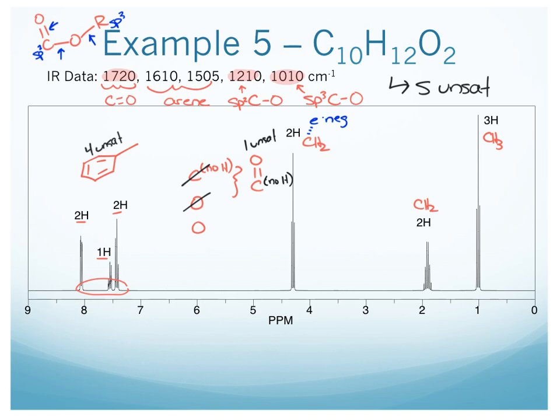So I'm going to start with this CH2 that is a sextet. Okay, there's 6 lines there, meaning it's connected to, take 1 away from that, so 6 minus 1 is 5, meaning it's connected to carbons with a total of 5 hydrogen. Well, that means we can easily connect the CH2 to the CH3 and this CH2. Okay, we have that connected.